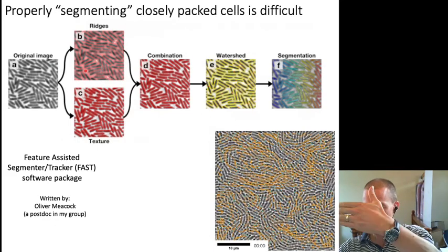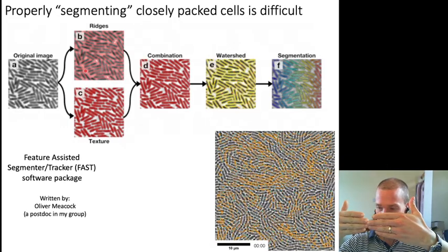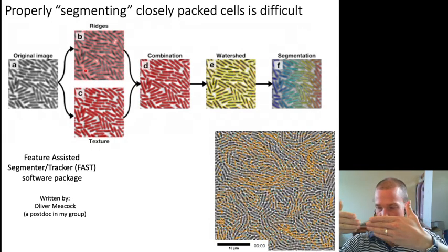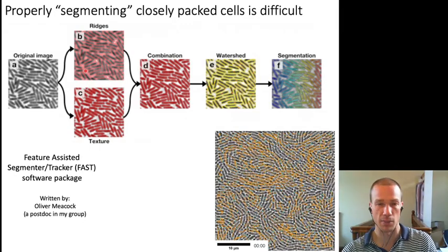So you have two cells which are close together. In one of these frames, they can potentially overlap with one another, which will trick the computer into thinking that there's actually one cell when there's in fact two. So when cells overlap and move apart, that really impacts your ability to track individual cells, because one of those cells will disappear whenever this happens.